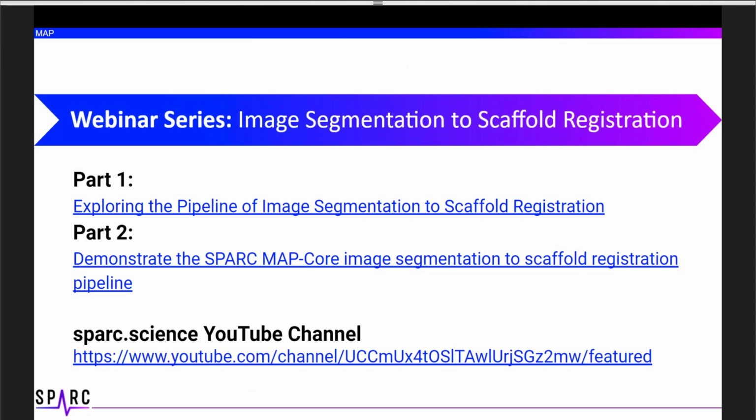We hosted a webinar series last month that detailed the image segmentation to scaffold pipeline. In part 1, Aidan and I demonstrated how to use FAIR segmentation tools in our software to create and prepare files for scaffold integration. If you'd like to learn more, we encourage you to please visit the SPARC.science YouTube channel, and you can check out part 1 and part 2. But today, we're going to take a closer look at how easy it is to access anatomical vocabularies from within our software and use MBF segmentation and editing tools to add metadata to existing files.